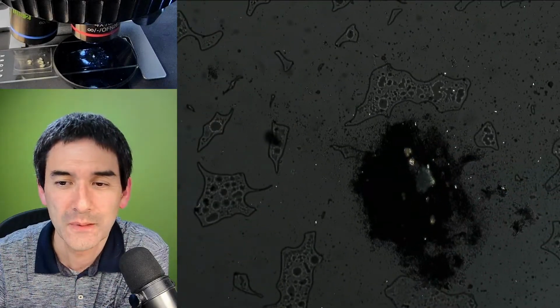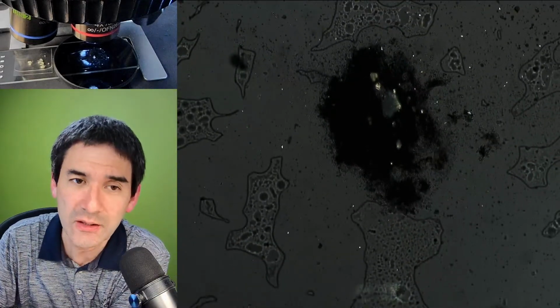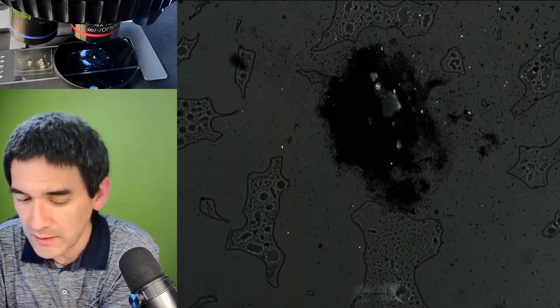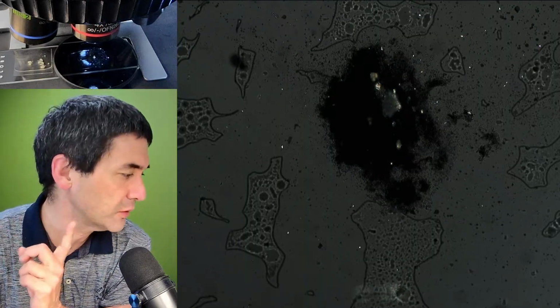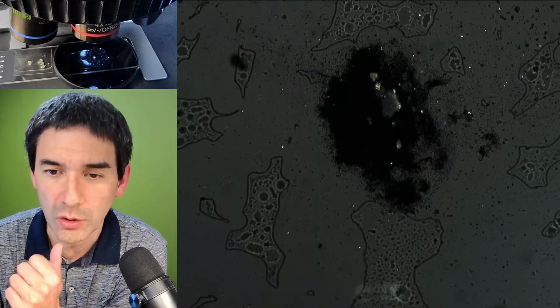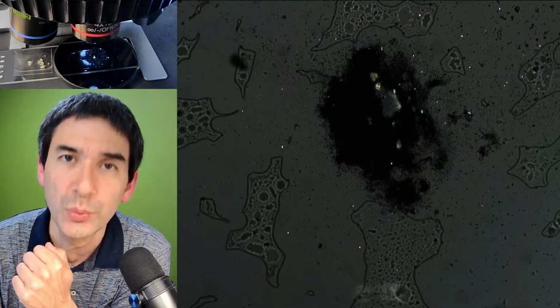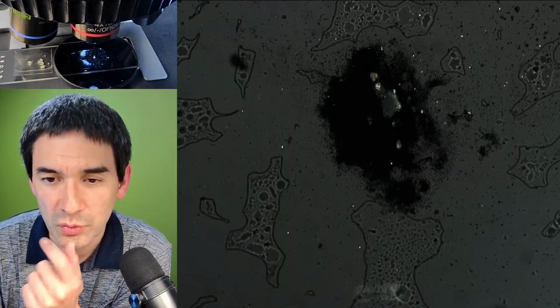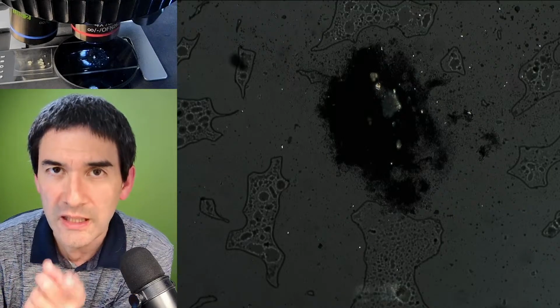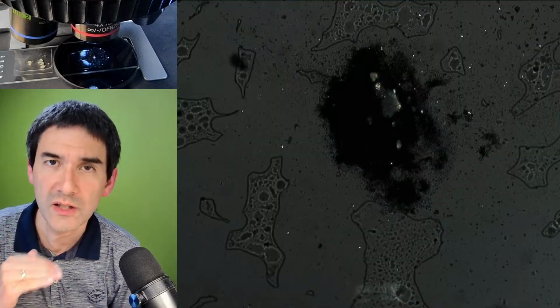Would salt crystals in the food glow too? First of all, I think I tried that once. Salt crystals are not polarizing, so I don't think so. I've not tried it with regular polarizing filters. However, if you have salt in food, food contains water, so the crystals would dissolve and you would not see them. To correct the comment: in food, not, because food is moist and this dissolves the crystals. It's got to be in a dry form.